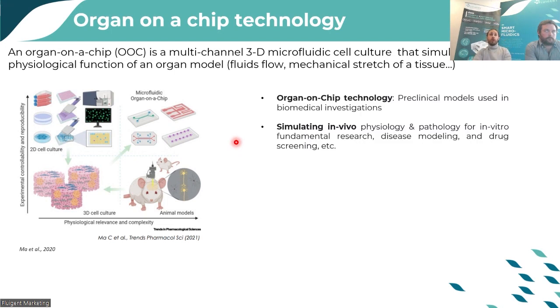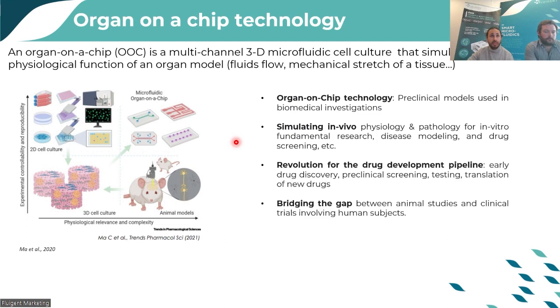It allows to develop preclinical models used in biomedical research. It simulates the in vivo physiology by flowing, for example, blood flow, stretching the membrane, as I said, and it allows many tests in terms of drug discovery and drug testing. It can also revolutionize the drug development pipeline.